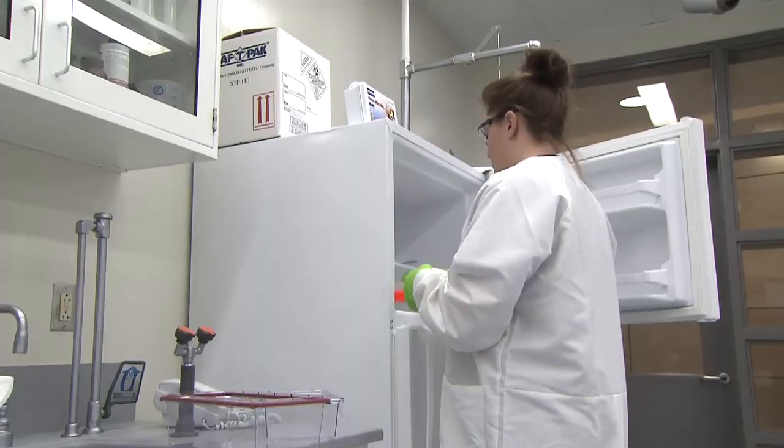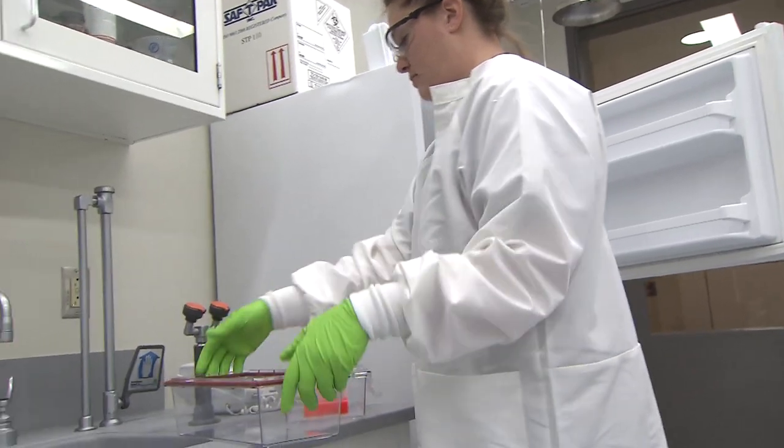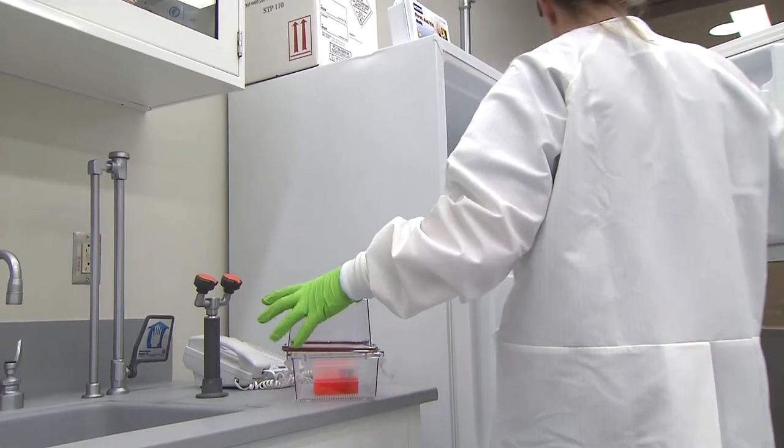One myth that people often believe about biosafety level three is that when you go into the laboratory there's stuff floating around in the air, and that's not true unless you have a pretty big accident and you spilled stuff outside of the biosafety cabinet. We use primary containment devices for all work.